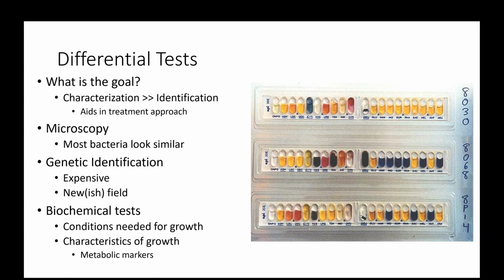We can't narrow down the bacteria to a single type of bacteria when we have all these options. So think about how difficult it was, the morphological unknown, and you only had, I think, maybe like 10 different bacteria, and you knew what the results were supposed to be. So imagine having a clinical sample where you have a very small amount of bacteria. It's a wild type bacteria, so we don't know the growth requirements for this particular bacteria. You don't necessarily have a pure, isolated sample, and you literally could have anything, right? You have no idea what kind of bacteria you could have. Narrowing it down simply using microscopy is very, very difficult in a clinical setting.